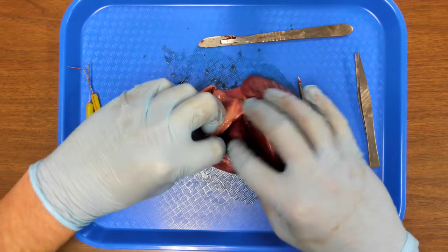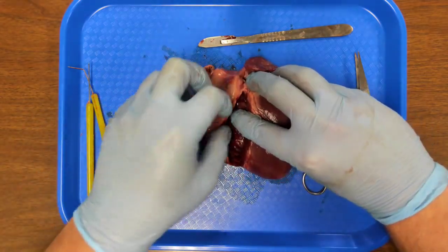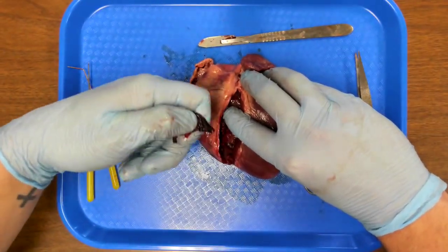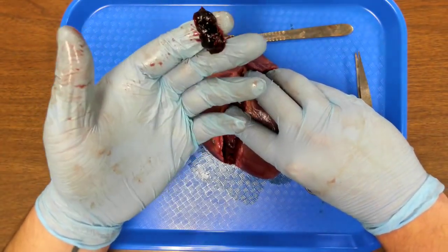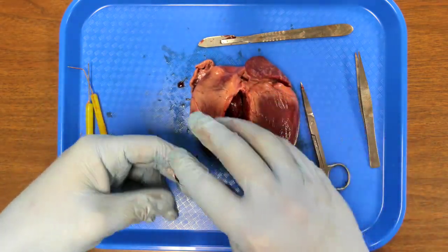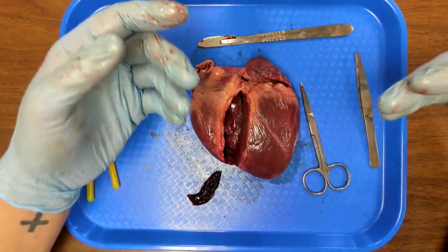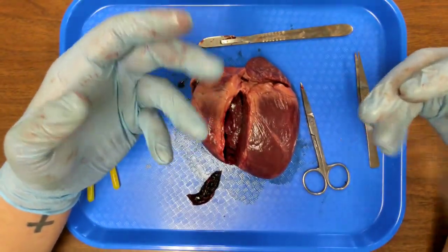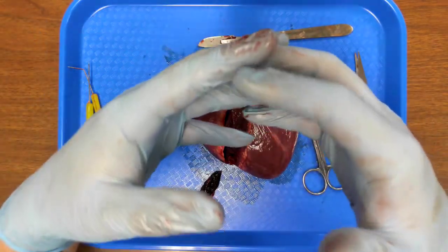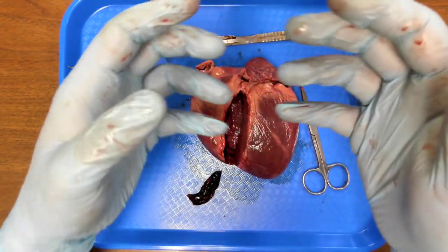All right. So I am in the right ventricle here now. First thing I want to show you. This right here, this is blood. This is clotted blood. Inside blood are these special cells called platelets. And it's just like if you get a cut and your cut doesn't bleed forever, that blood starts to come together. It starts to clot. And it stops that bleeding.